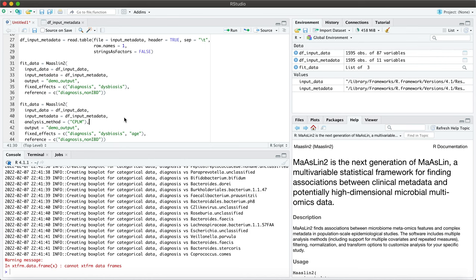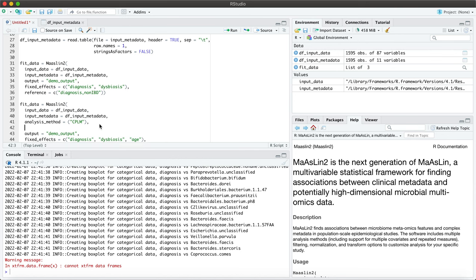If you're using non-count data like CPLM, then you can normalize using TSS or CLR. For the purposes of today, let's just do none for both normalization and transformation.